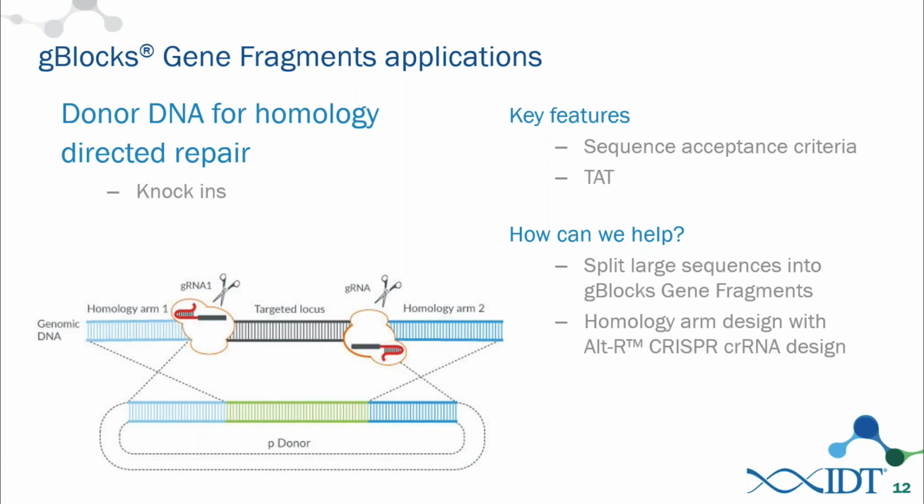They make a nice suite of tools that can be used for design. There's a lot of codon optimization tools. There's some CRISPR design tools in there, so they have a very nice option. The guys at Benchling also have a great tool that's available. They also have an electronic lab notebook that you can use to store and collaborate with your colleagues. A lot of nice design options in there, including some CRISPR design tools as well.